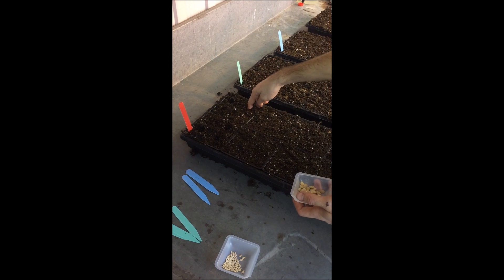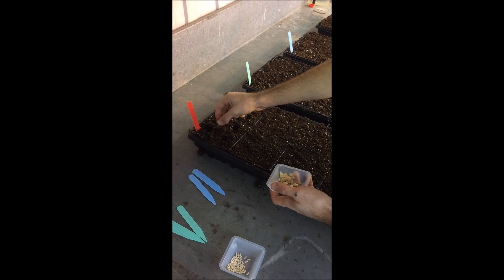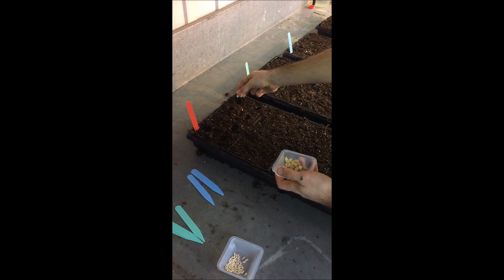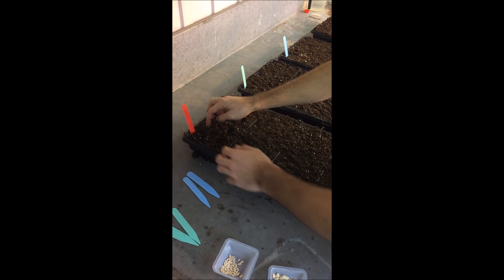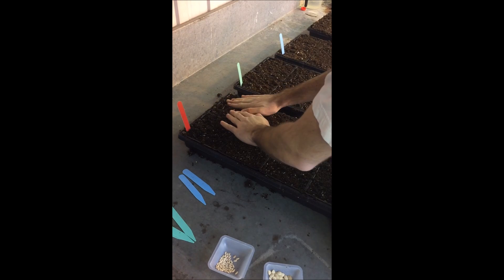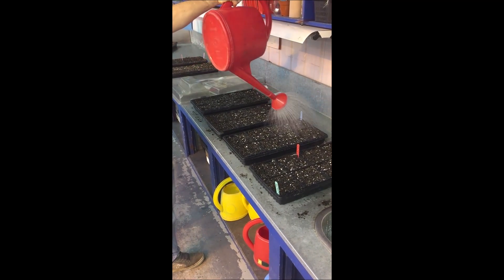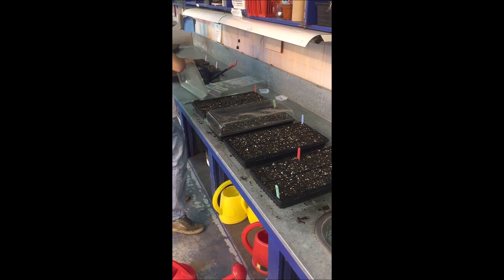Now that the trays are filled, one cucurbit seed is planted per cell at about 2 cm deep. The seeds are recovered with soil and the trays are properly labeled for each cultivar. The trays are watered again and a plastic lid is added to keep a high relative humidity and increase the temperature, which will increase the seed germination rate.